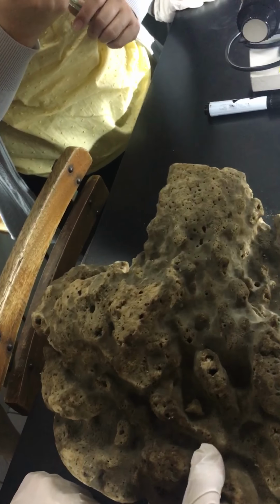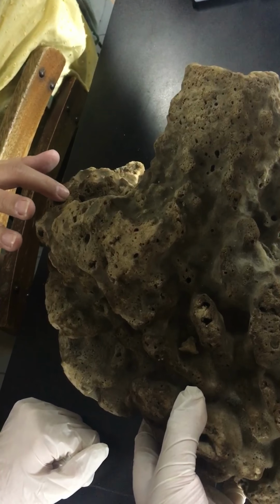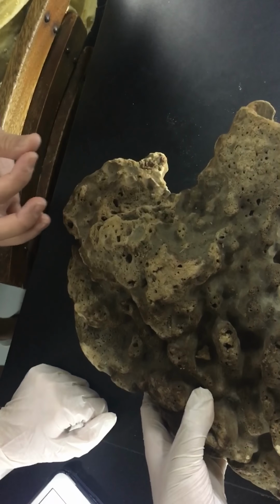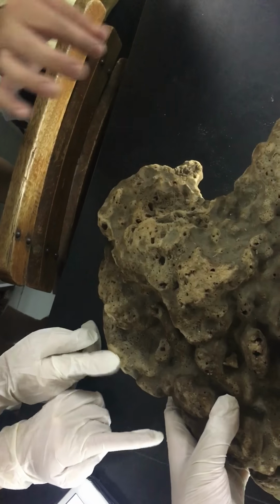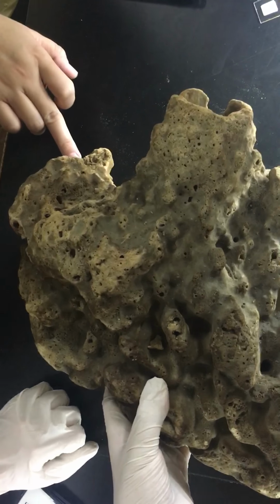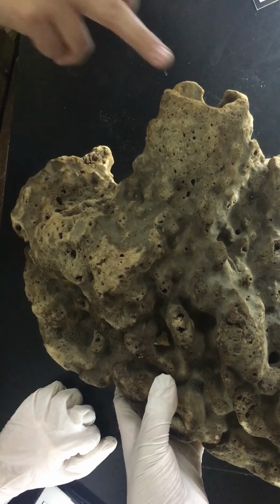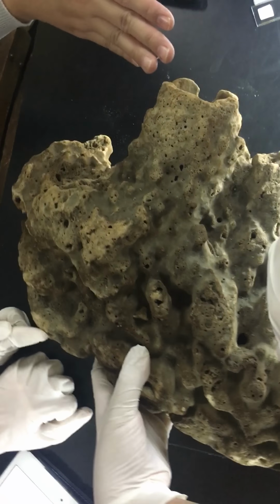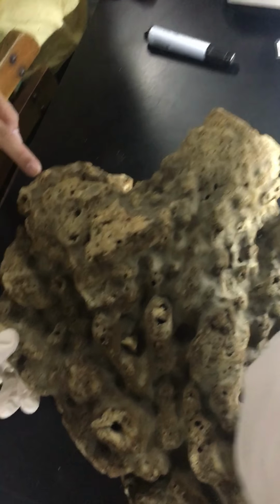Okay, the choanocytes. So you would expect that in this area, these are the outer part, the pinacoderm area. So it is a bit rough, right? That is actually because of the spicules present in them. Okay? So notice, they have many osculum areas. 1, 2, 3. The space is actually the spongocoel. The opening at the outside is the osculum. Okay? These small ones are the ostia. Next, this one is Xestospongia.